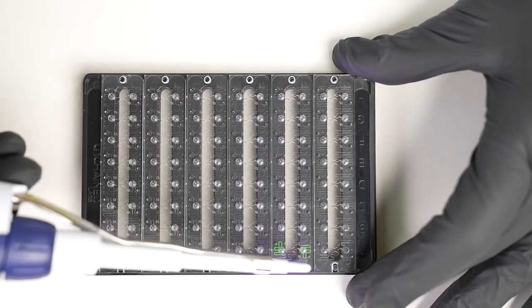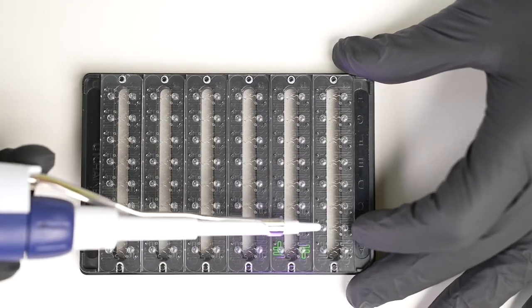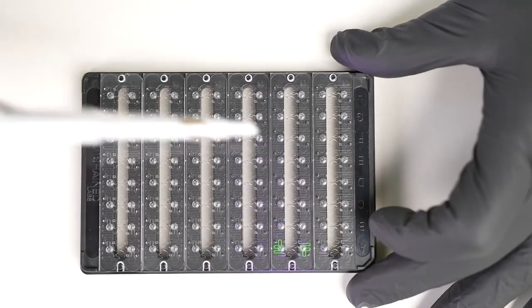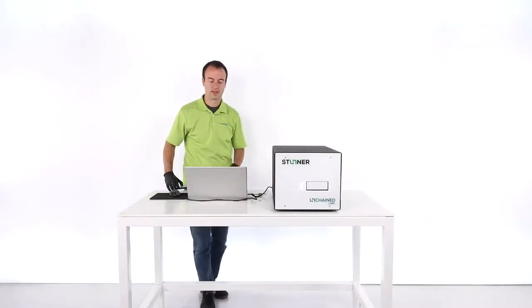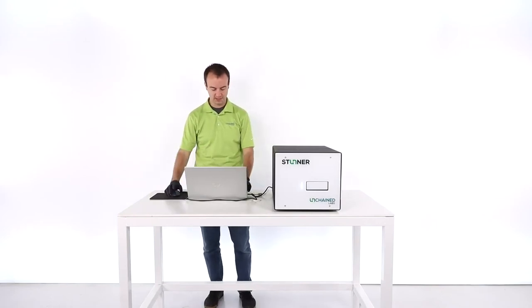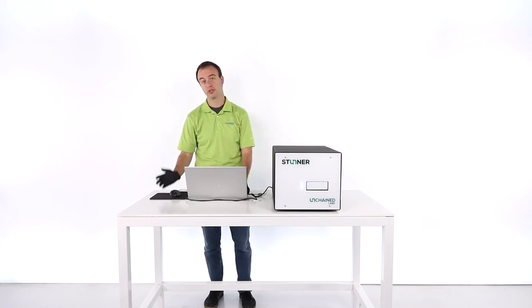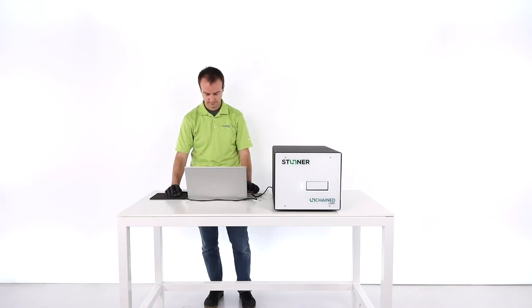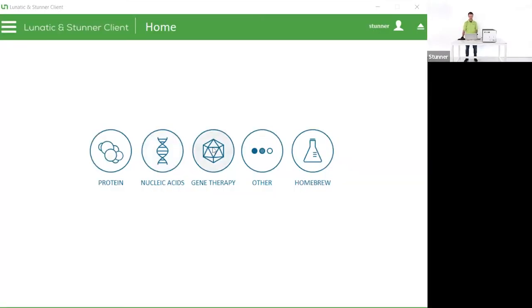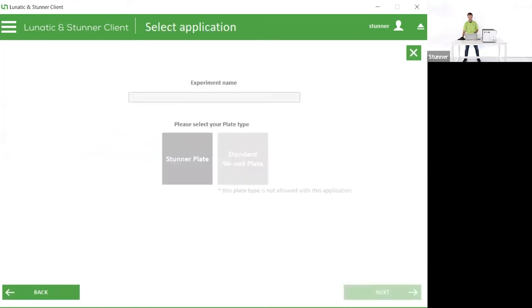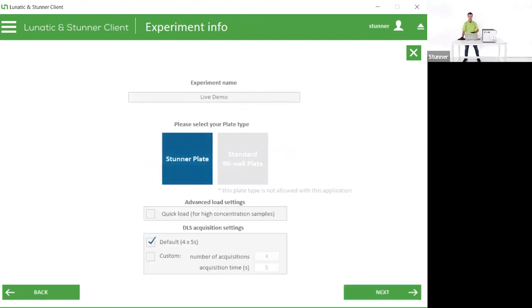What we'll be doing with this is taking it over to the Stunner software, setting up a run, and then we'll be looking at results for AAV that we ran a little bit earlier today. So first up in any experiment on Stunner will be to go ahead and set up the client software. I've already logged into the software here. The first screen gives you a brief idea of how many different applications Stunner can run and how many different sample types it can work with. We're going to dive into the gene therapy menu and pick the AAV quant application. It's pretty simple to name your experiment and pick your Stunner plate, which is going to be more than 99% of experiments you'll run on Stunner just using the default settings.